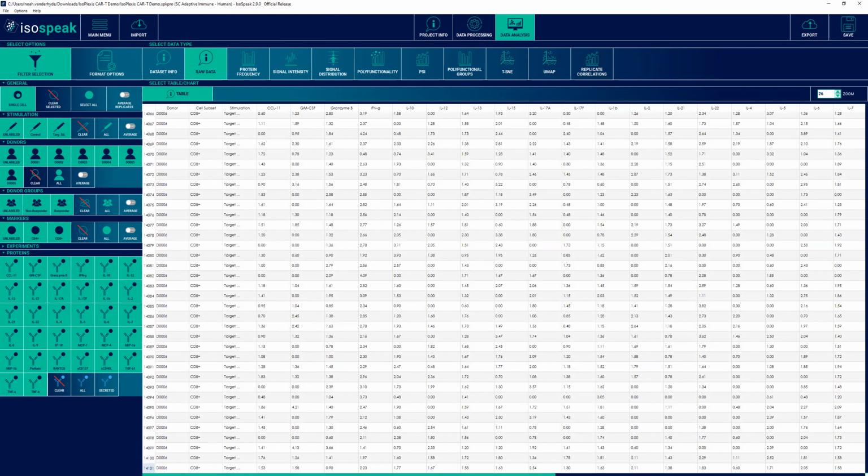From 24 chips, this number right here is the number of cells generated. So we have 14,000 cells from this data set multiplied by our panel of 32 cytokines specifically on this panel, and then 2 extra metrics, the polyfunctionality and PSI. That's over 14,000 times 34 data points from just these analyses.